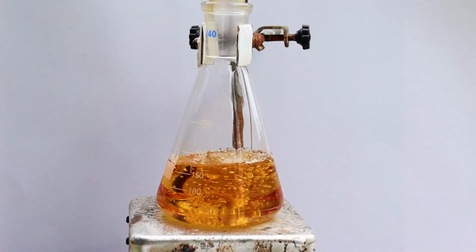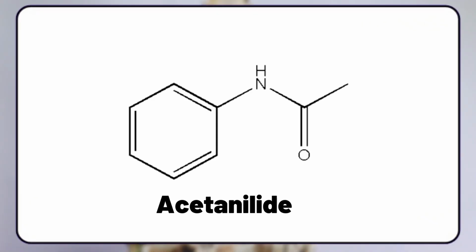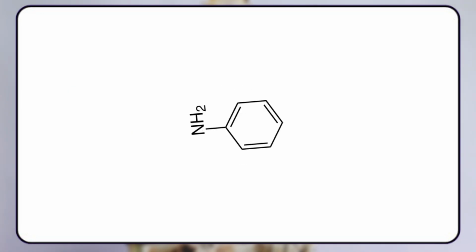Hello and welcome back. Today we will be making acetanilide. It's a useful reagent in organic synthesis because it can sometimes be used instead of aniline.